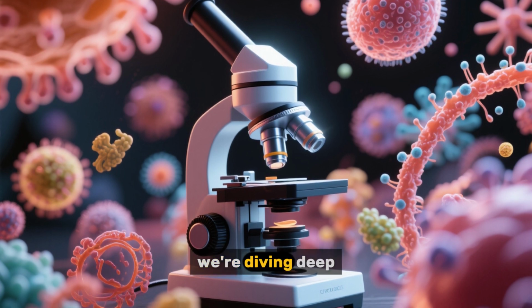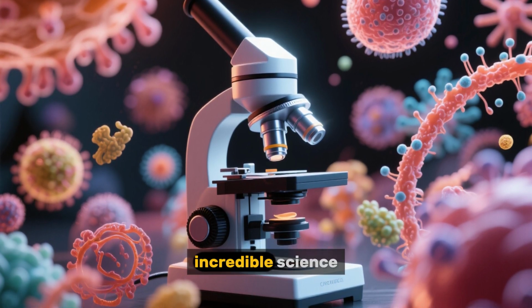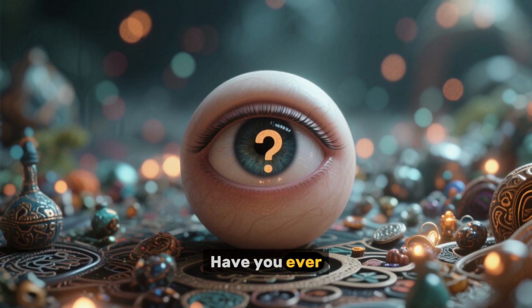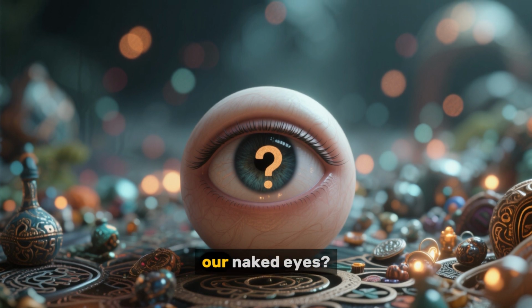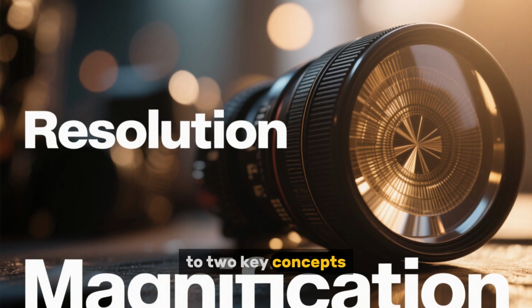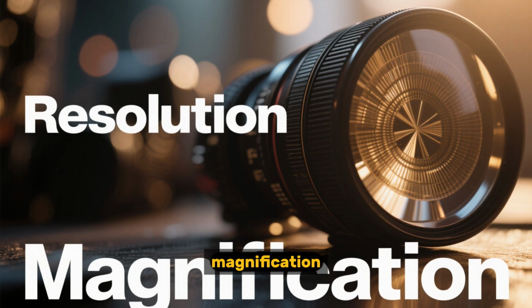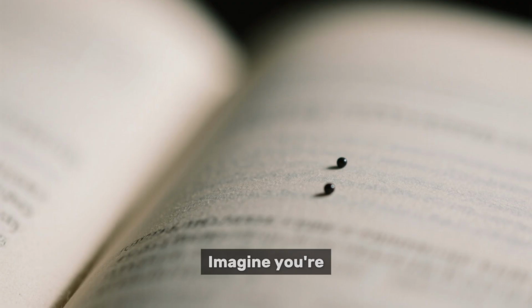Today we're diving deep into the world of the unseen, exploring the incredible science of microscopy. Have you ever wondered how we can see things that are way too small for our naked eyes? It all comes down to two key concepts: resolution and magnification. First up, let's talk about resolution.